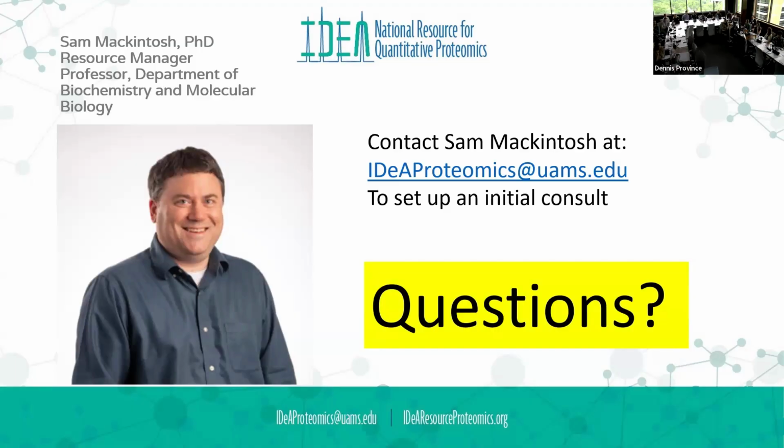Okay, Divya. Because tryptic digestion cleaves at the lysine residue, and when we are looking at ubiquitination, the ubiquitin chains are connected at the lysine residue, will that affect it? It does. The trypsin doesn't like to cut where there's been ubiquitination. So our missed cleavage rate should be about 10% or so. It goes up to 50% when we do ubiquitin samples, which means there's been a lot of ubiquitination. That's great. We're seeing a lot of that.